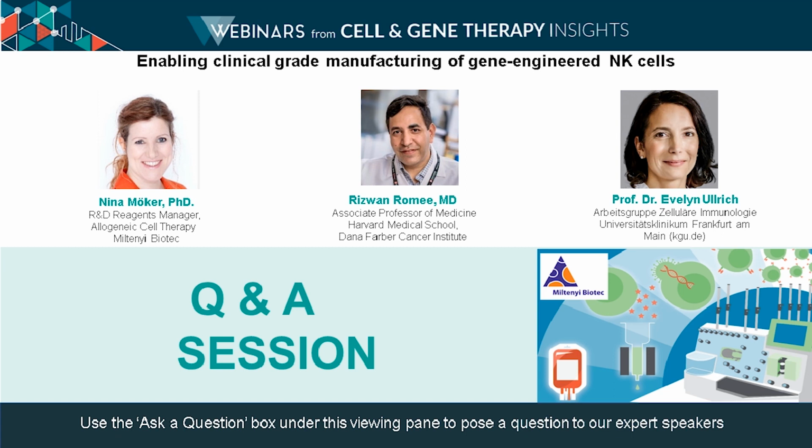And this is something that a lot of people, including ourselves, have been guilty of underestimating. So to help with this, it's really important to have automation also in the accompanying in-process control and quality control of the cell product.